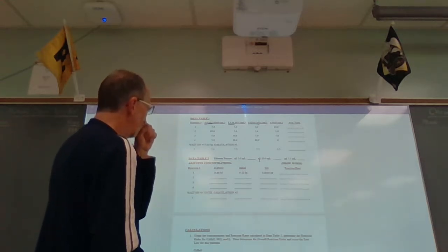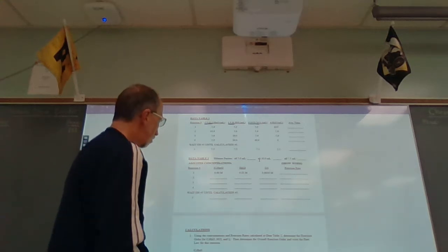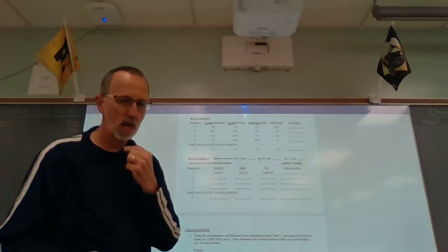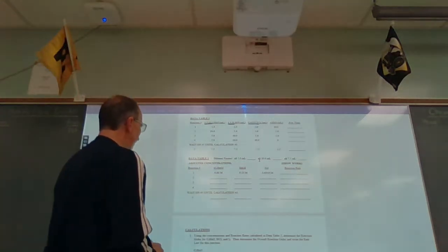Now, in data table 2, which is the important one, it talks about adjusted concentrations, all right? Adjusted concentrations. Here is why that says that, all right?